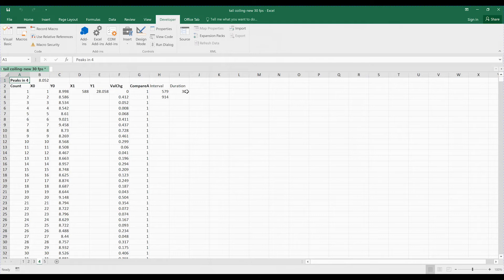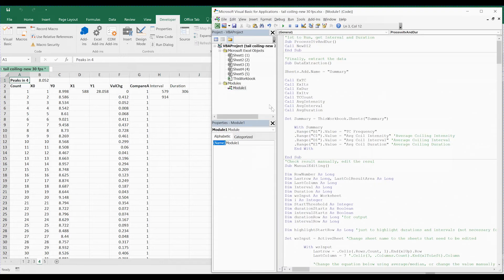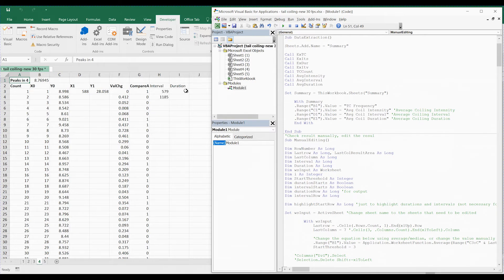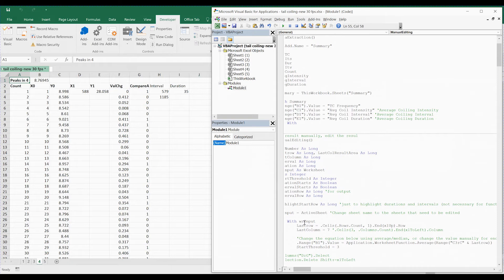The next one has a duration of 300 frames, which — because our video is 60 FPS — means 5 seconds of tail coiling. This is unusual, since tail coiling typically happens around 0.5 to 1 second. So we need to change the end threshold value. In the Manual Editing macro, I set the end threshold to 'average' to increase the end threshold value. After running it by pressing F5, it now makes more sense because the duration is around half a second. This manual editing only runs on the sheet you are currently selecting.